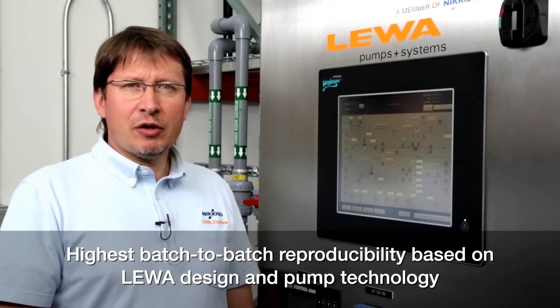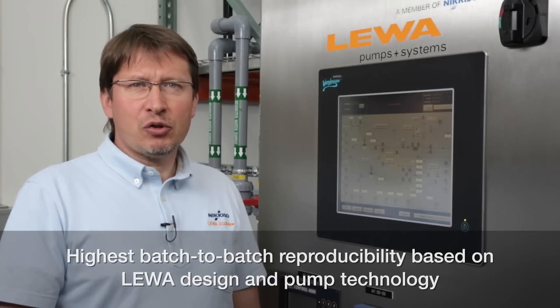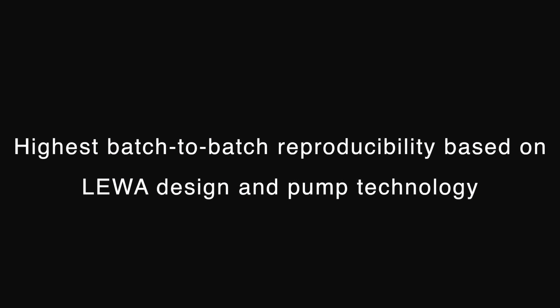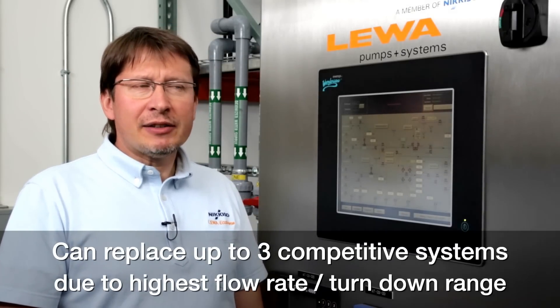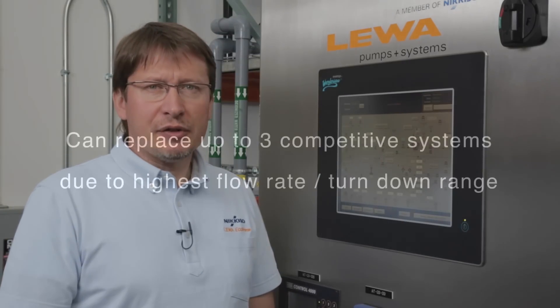The system has several benefits. First, it is designed to give the best batch-to-batch reproducibility. Second, one LEVER EcoPrime unit can replace up to three competitive systems in the market, and it has very exceptional accuracy over a wide range of flow of the system.